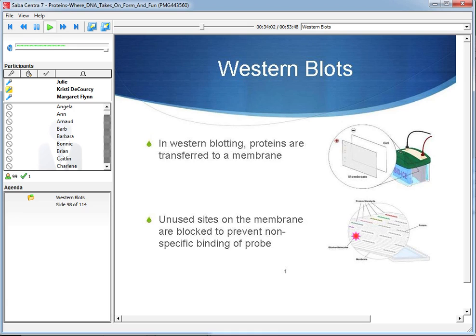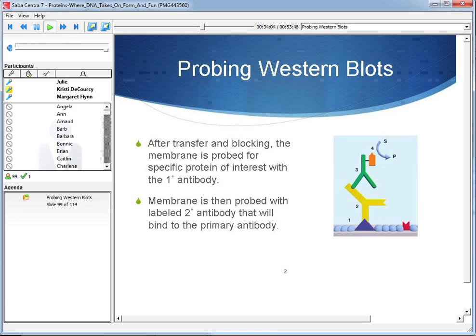So once you have your proteins blotted onto the membrane, you're now going to probe for your protein of interest. And here's a great little graphic. I assume some of you have done immunoassays like the ELISA assay. Well, the principles are exactly the same in Western blotting. Say our little purple triangle is our protein of interest. Say it's myosin, a muscle protein.